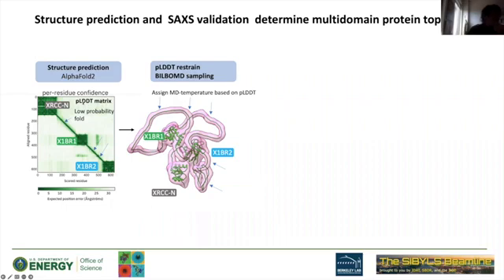And it seems, based on this PAE matrix, the expected position error between aligned residues, that there are some non-folded regions, but most likely flexible. But still, AlphaFold comes up with a very compact topology between those 3 domains. So what we are doing, you can use the MultiFoXS web app and just add those residues as linkers, or you can also use Bilbo MD that is part of our web app. You can just look at it right now. And we are able to assign the flexibility in a much more interactive way in our web app application.